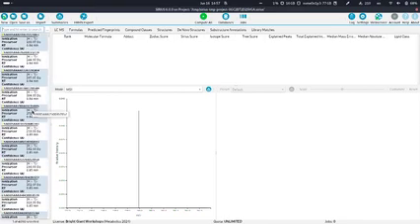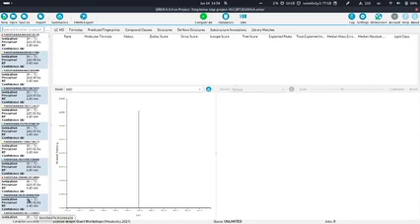So now we have our compound list. You can see at the bottom that we have apparently 4,090 features here. It might vary for you depending on how many files you dragged into this SIRIUS window from the mzML files.